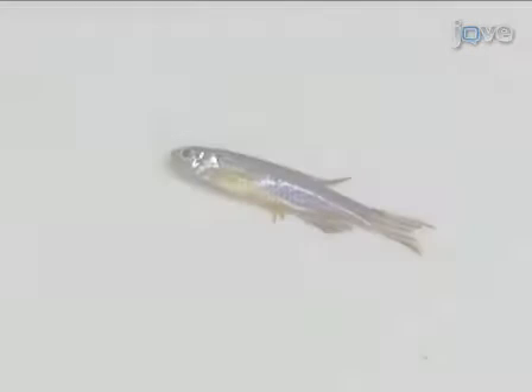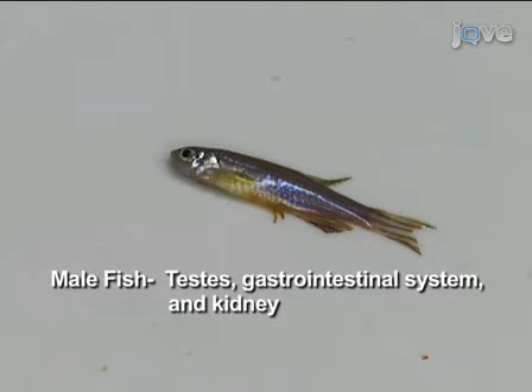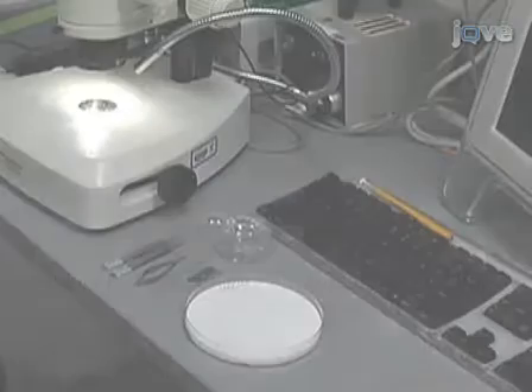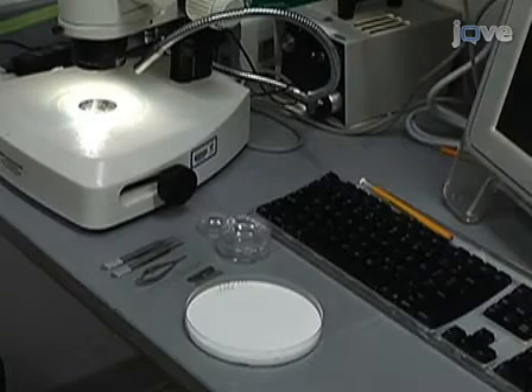For clarity and ease of dissection, the testes, gastrointestinal system, and kidney will be dissected from a male zebrafish, and then the ovaries, heart, and brain will be dissected from a female. To reduce the amount of food in the intestine, do not feed the fish the day prior to the dissection. A male zebrafish will be dissected first.